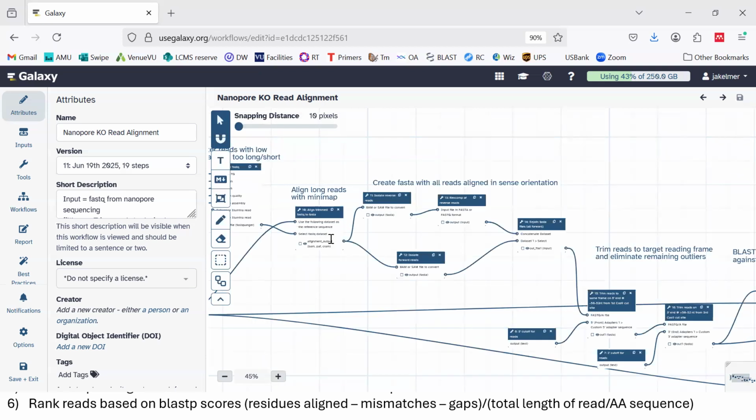So you'll notice there's a fork in the road here. What I'm asking SAM tools to do is create two FASTA files for me. This top one will isolate all of the reverse reads. The bottom one will isolate all the forward reads. Now, when I say forward reads, I mean it contains the same sequence, the coding sequence that I'm expecting. So it would go ATG, right? So these are the reads. This is the orientation that I want down here with the forward orientation.